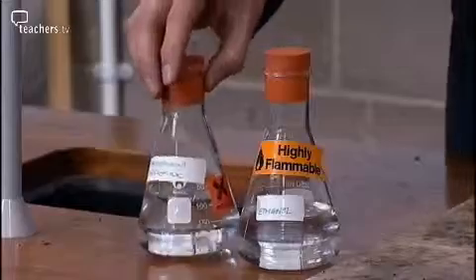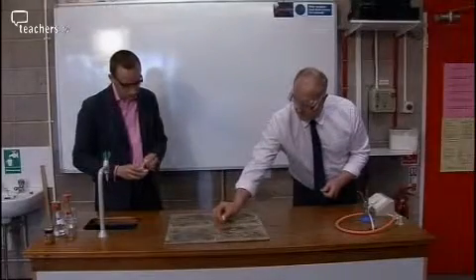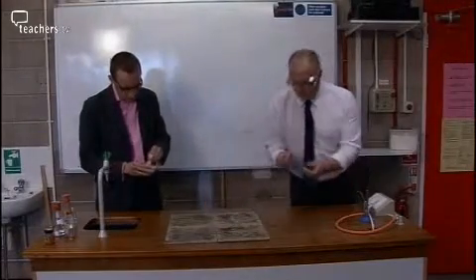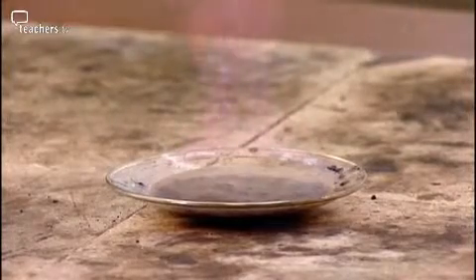We're going to start with a 50-50 mix of ethanol and hydrogen peroxide, and we're going to set fire to that mixture and then add an additional oxidising agent in the form of potassium manganate(VII). So that's burning. All we're going to do now is drop some of our manganate crystals on top and you'll see what happens. The lovely purple flashes — we've got our purple again. The crackling is tiny little pockets of intense burning and that's exactly how we create a crackle in a firework. It's intense burn followed by a low energy burn, intense burn, low energy burn, exactly as we've just seen there.